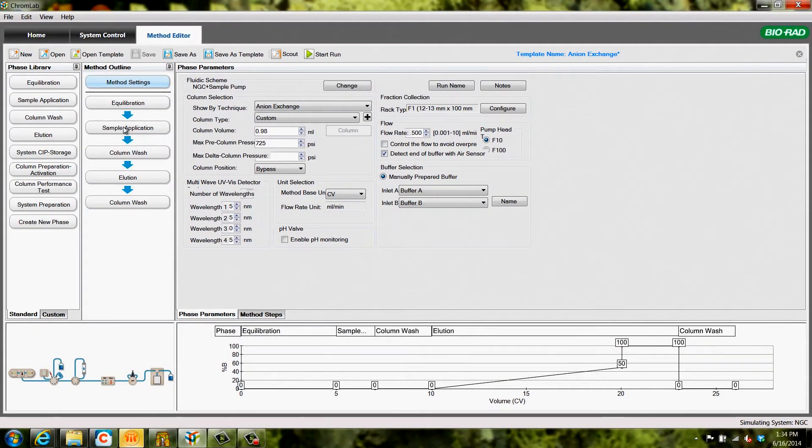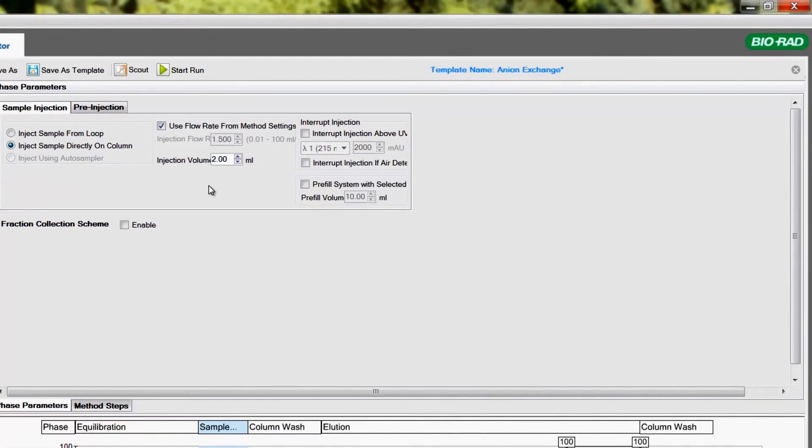For the sample application phase, if using the sample pump with an air sensor, check the box next to interrupt injection if air detected.